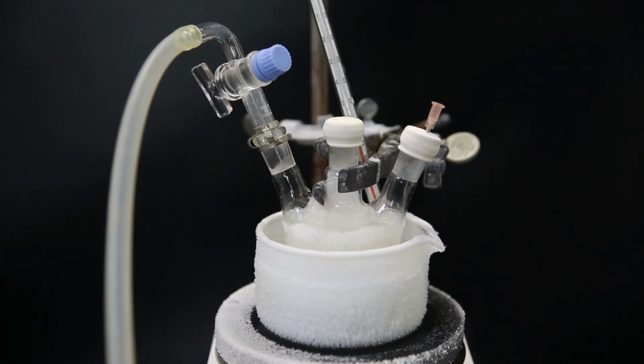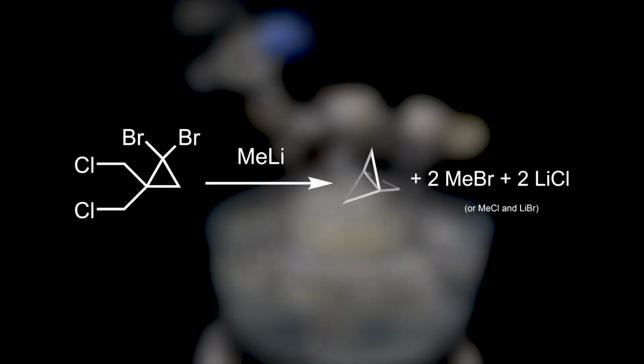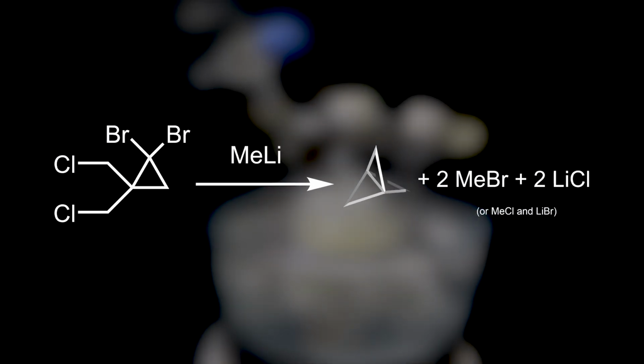When that is done, I leave it to stir in the bath for about 15 minutes. Then I take it out and set it in an ice bath for an hour. In the reaction, the reactant undergoes a double transmetalation with methyllithium to form 1,1,1 propellane.